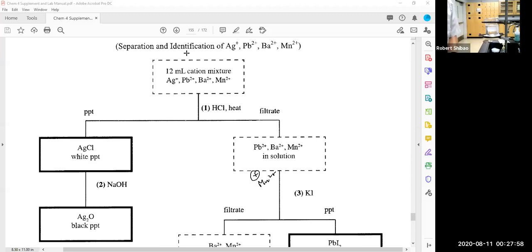When you get to organic chemistry lab, we don't have to use things like this. We get fancy little things called lab jacks. A lab jack is like a little elevator platform. You twist a knob and you can raise things up or lower things down. It makes adjusting the height of things a lot easier. But we don't have a lab jack, so I'm just going to heat this like this. Now I could put some boiling chips in there as well, to promote smooth boiling. So let me grab some boiling chips and then we'll be all set for this.